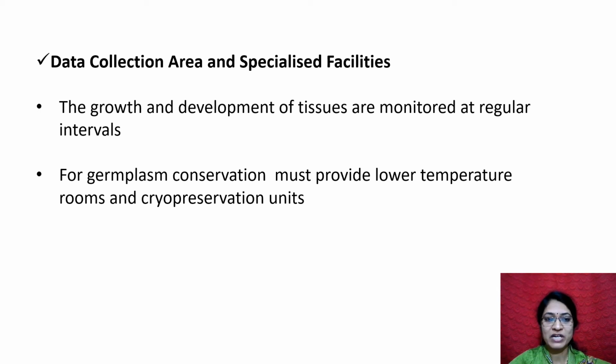Later, after 1 week, we must see whether any growth takes place in the culture. Then the growth and development of tissues are monitored at regular intervals. For germplasm conservation, we must provide lower temperature rooms and cryopreservation units. These are the specialized facilities which must be there in the data collection area, and the growth and development must be monitored regularly.